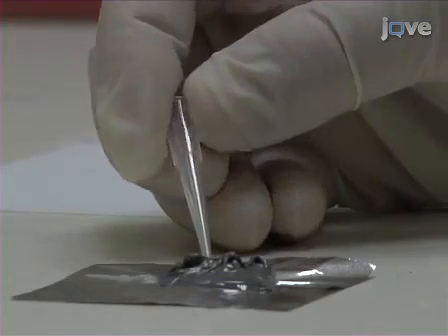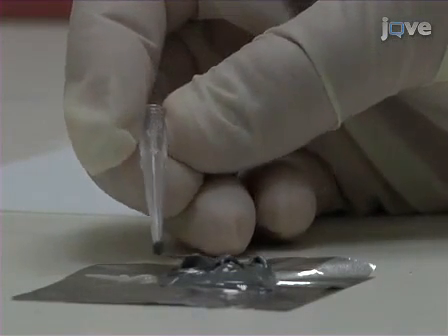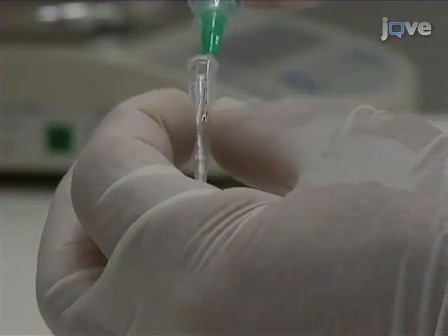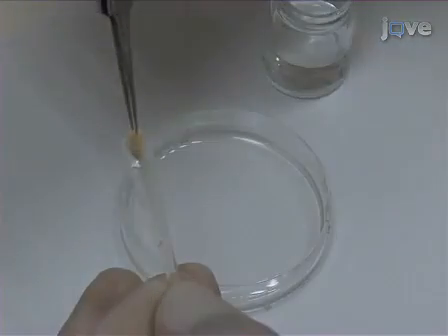Begin by sealing the narrow end of a polystyrene pipette tip with glue, like epoxy resin. Then, fill the tip with a working buffer, in this case PBS. Now, fit the leg with exposed femur tightly into the tip.